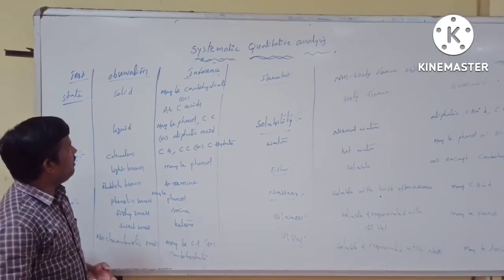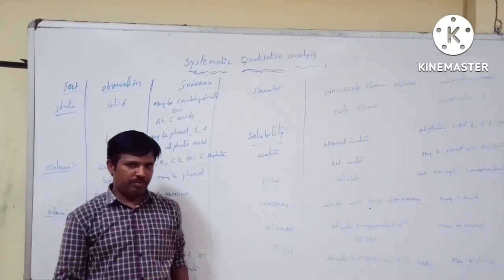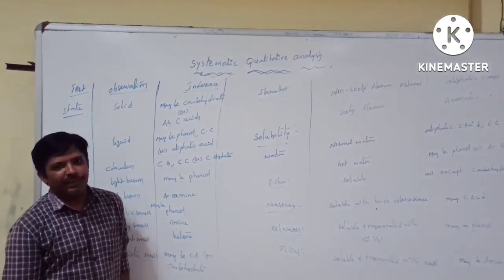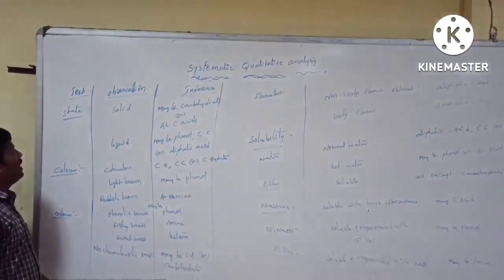Okay guys, in this video we are going to discuss the qualitative analysis of organic compounds. Analysis of organic compounds also comes under qualitative analysis, not quantitative. In organic compound analysis, what are the preliminary tests?